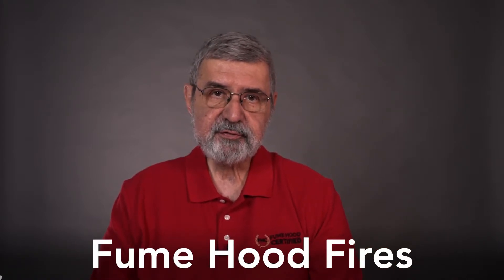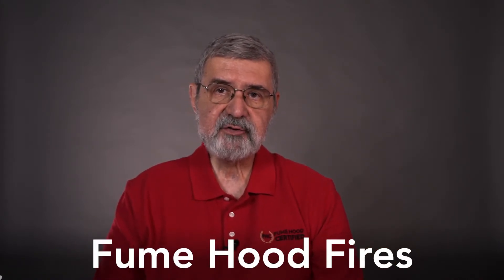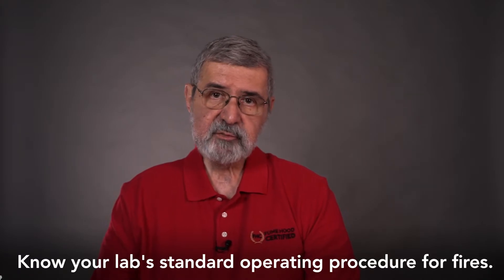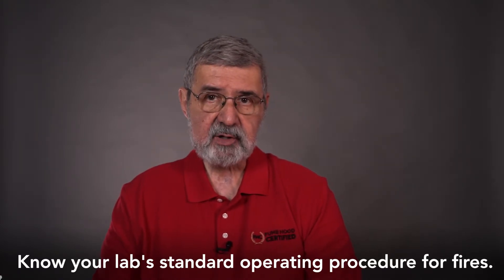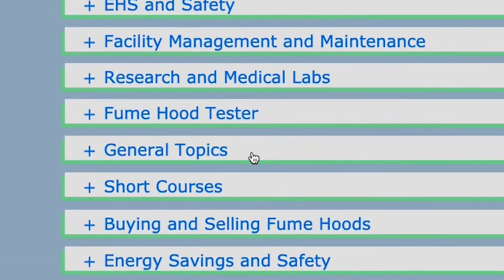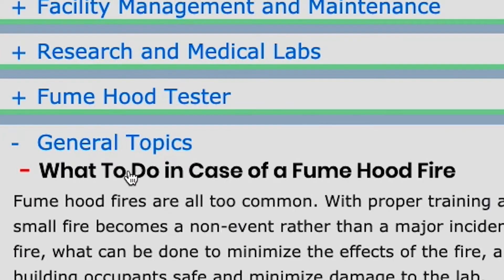Fume hood fires are another common hazard. While there are many reasons for fires, let's look at the role of the sash. In case of a fire, close the sash completely to minimize the amount of air feeding the fire. The sash also keeps the fire inside the hood and minimizes its spread. The proper action when a fire occurs varies — you need to understand the SOP of your lab and respond accordingly. We offer a training module that focuses specifically on fume hood fires.